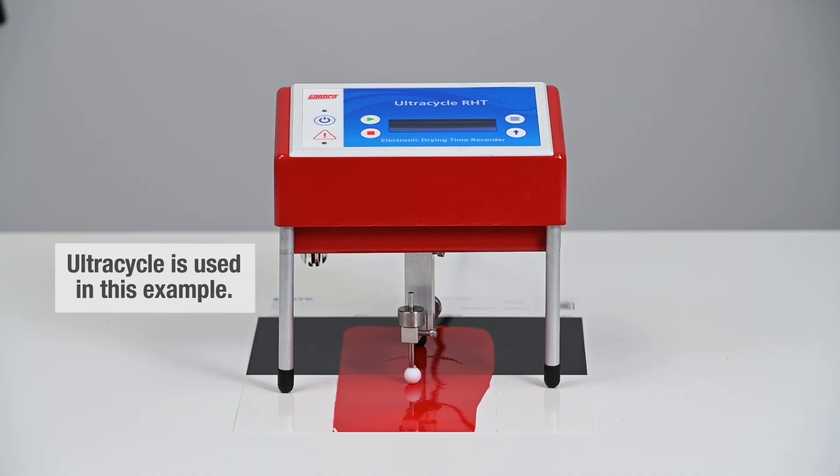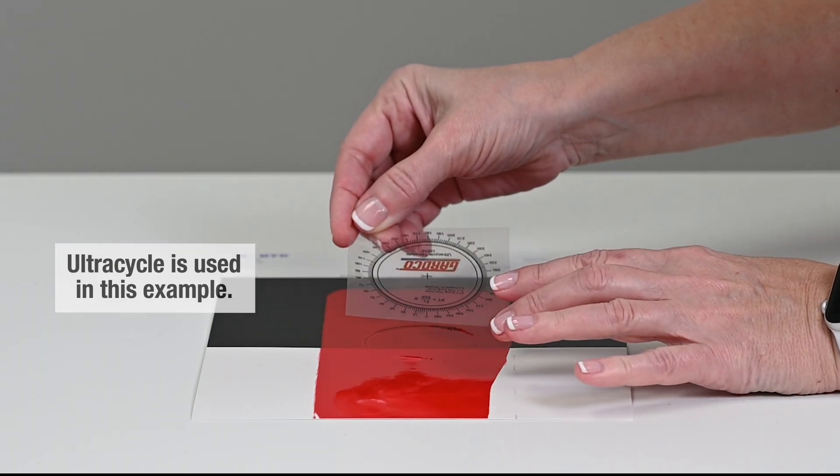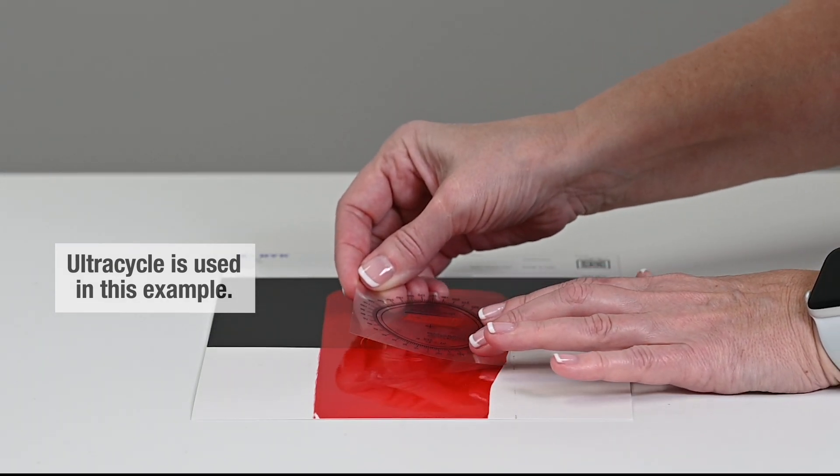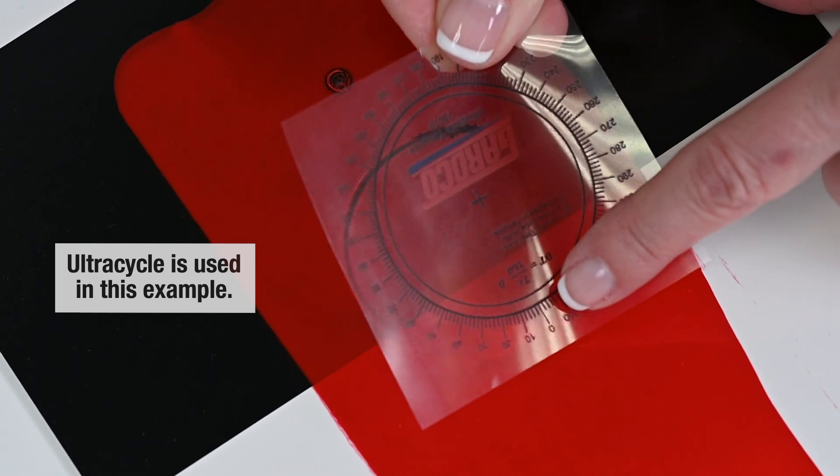Once the selected time cycle is completed, the drying time recorder will automatically stop. Lift the DTR off the sample and place the time template over the circular area scribed by the stylus, making sure to align the zero mark to where the test began.